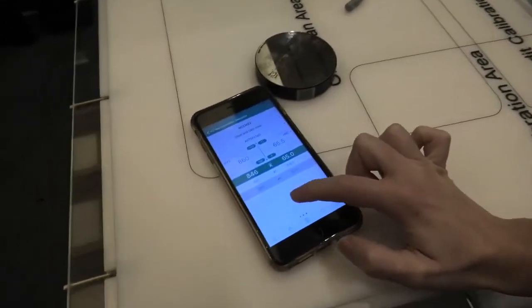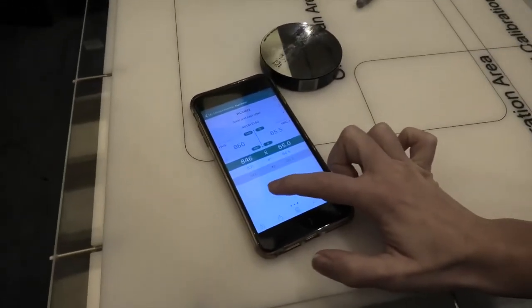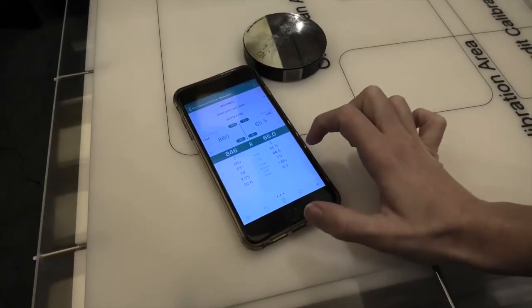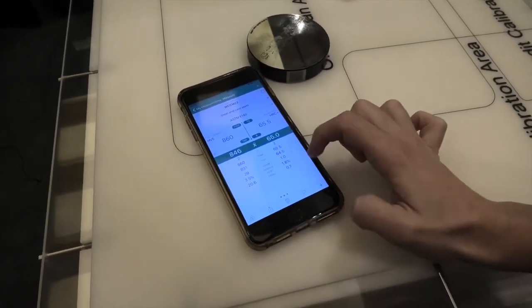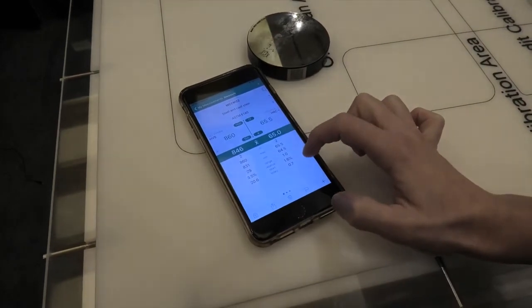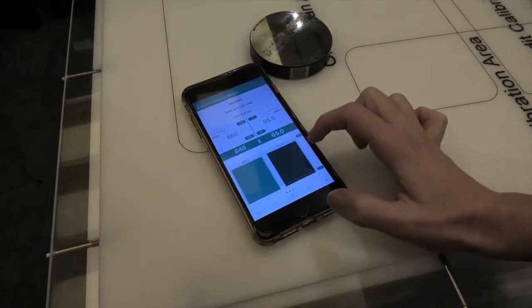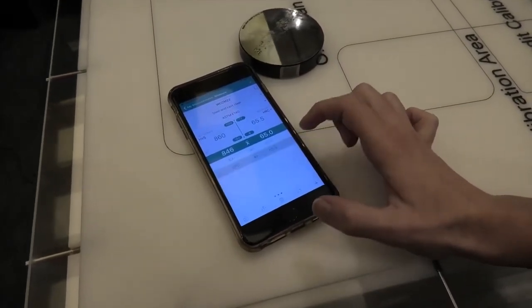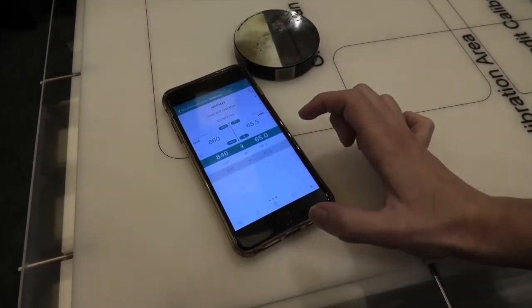And here we can swipe left to right to see the statistics of our measurement sets, a chart, or the individual readings.